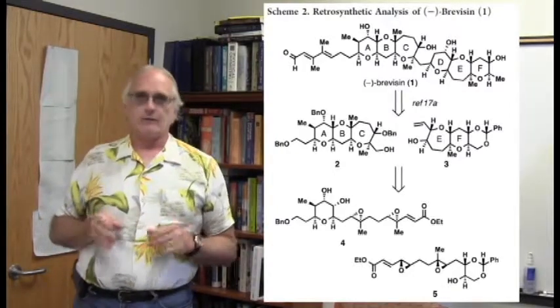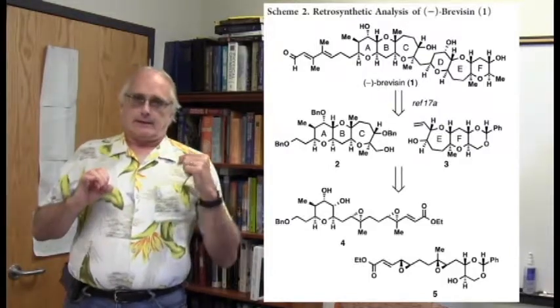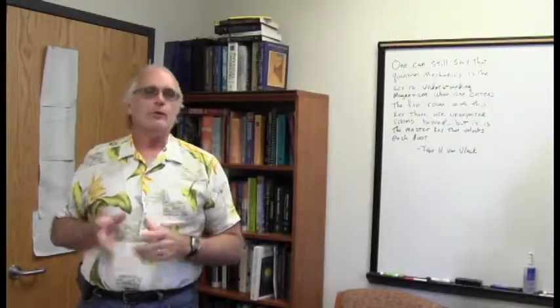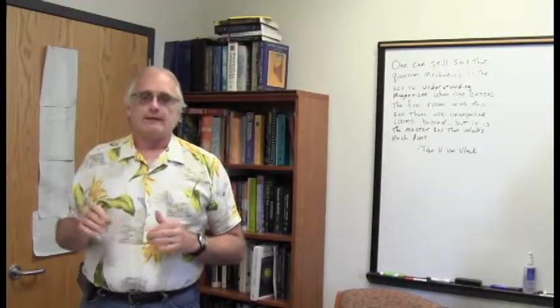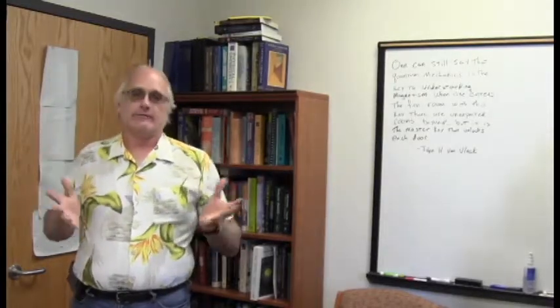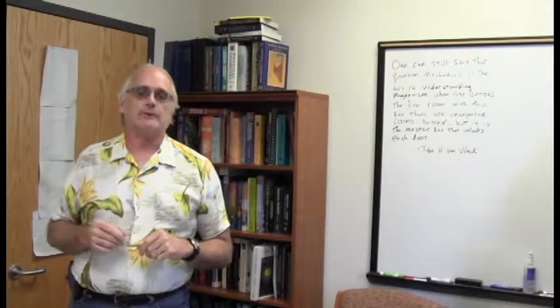You can see they're big old cyclic molecules, natural products. Oh, this would be just this horrible, messy set of NMR spectra, and it is. Now I want you to see a couple of things from this. The supplementary material to this paper is over 200 pages long. It's extensive. It's some of the most extensive that I've ever seen. And the work that put that thing together, it's got to represent several graduate student half-lives. Who cares, they're graduate students, but there's an enormous amount of work represented by this one paper and in this one project for synthesizing this compound.